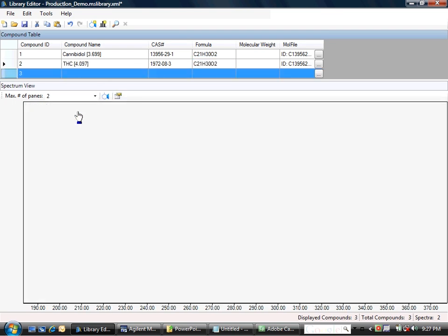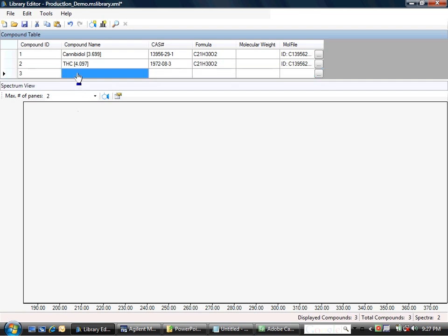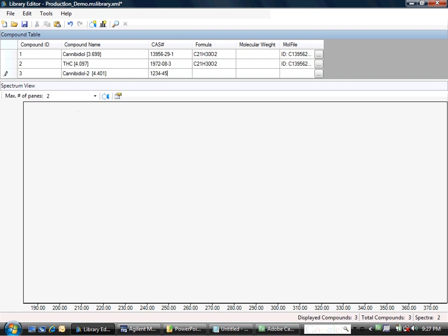That creates a new compound, which is blank here, and I will now give it a name. I'll call it Cannabidiol-2, and of course I could enter in CAS number, formula, molecular weight, and even the mole file as shown in another section. But what I want to do next is to enter in the spectral information.